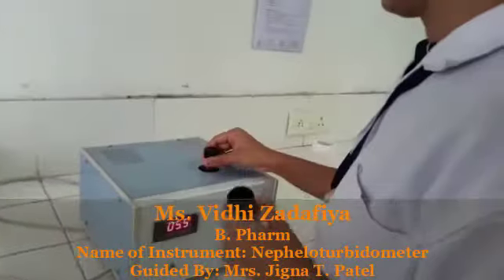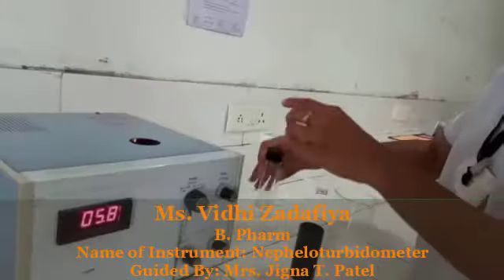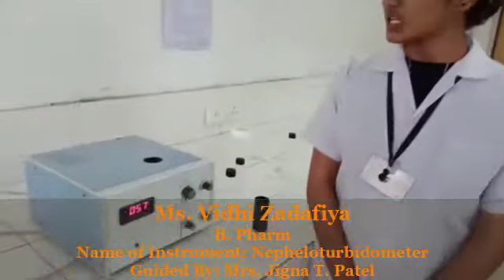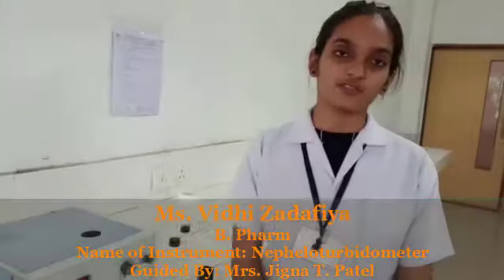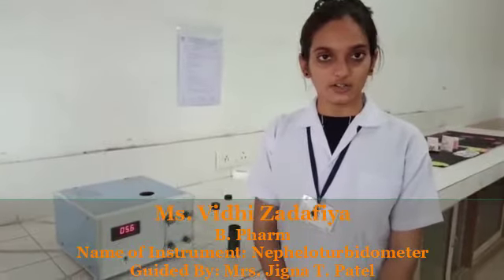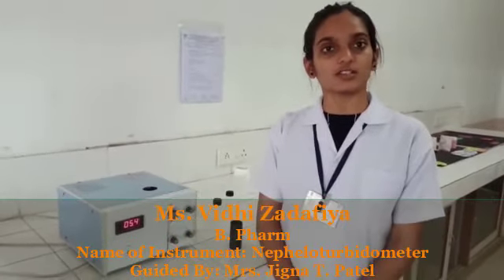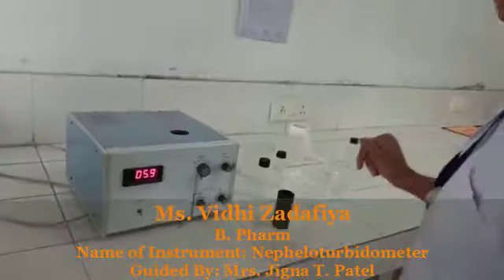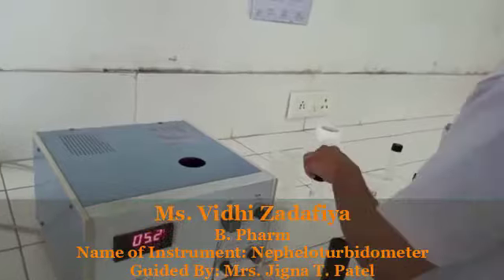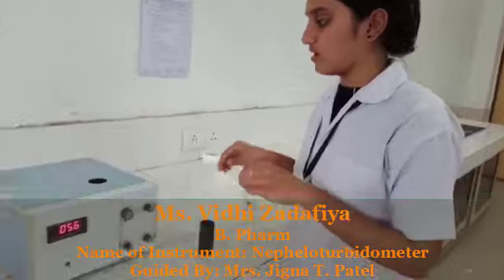Take the test cuvette. As per the procedure, we have to calibrate this instrument with a standard reference solution. Here we take two types of reagent: first is the 100 NTU solution for setting the 100 value, and another one is distilled water for the set zero. We have already prepared a 100 NTU solution. Clean it with tissue paper and place it in the instrument.